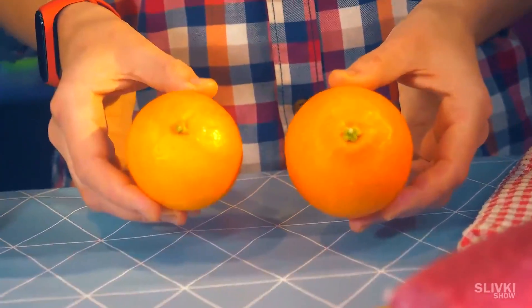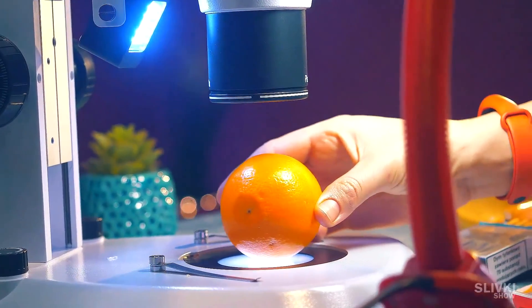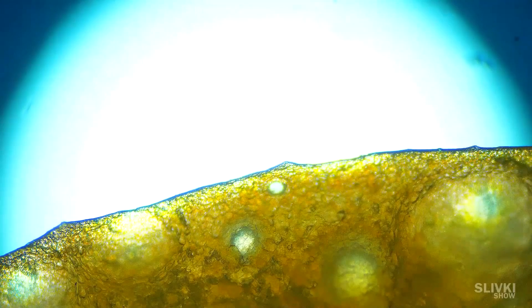A lot of people wanted us to look at a tangerine peel, so I thought — why not — and in the end I didn't regret it. Look at what's inside a peel: there are strange holes, or I would even say craters of small volcanoes. Perhaps the tangerine is breathing through them or giving off some kind of odor. I don't know what their purpose is — I'd be interested to read your guesses.